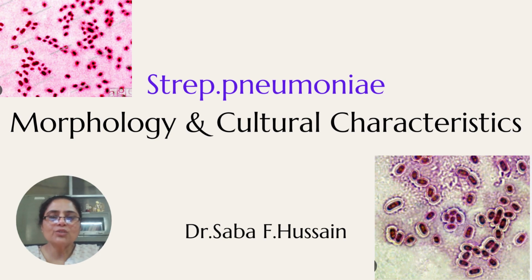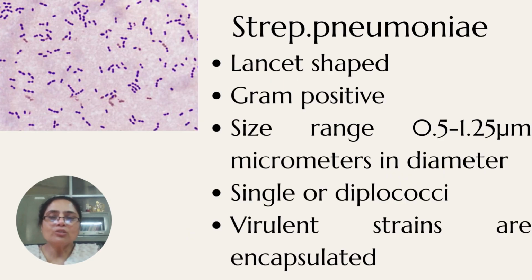Hello everyone. Today we will be studying about morphology and culture characteristics of Streptococcus pneumoniae. So let's come and see the microscopic picture of Streptococcus pneumoniae. How it looks in microscope.